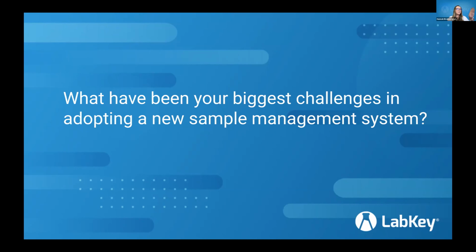I still see some people answering, so I'll do one more question before we move on. Is LabKey Study something different from the study folder type? No, it's not. LabKey Server, as you heard about on Tuesday, has a study module or that study folder that Brent is talking about, and LabKey Study is just our short way of describing that functionality within the server.